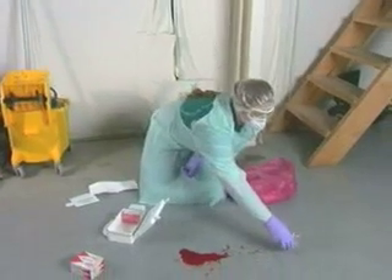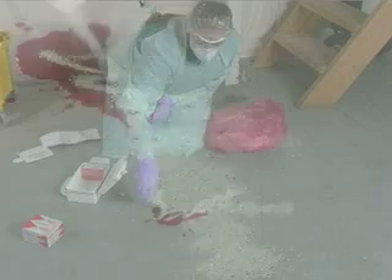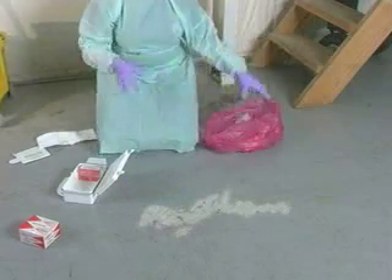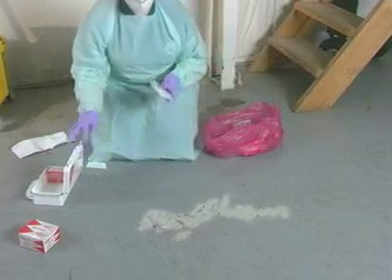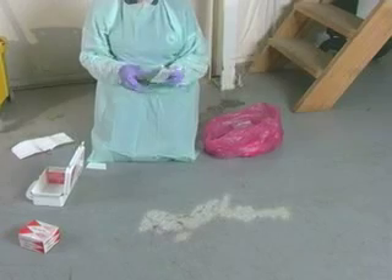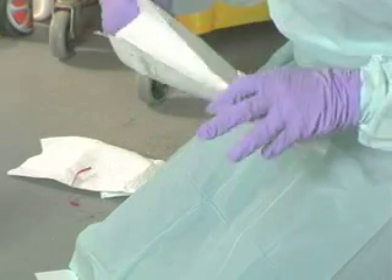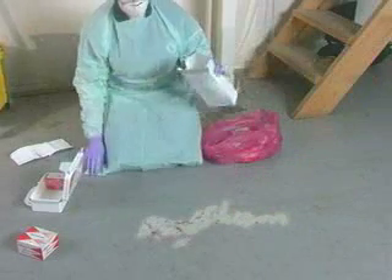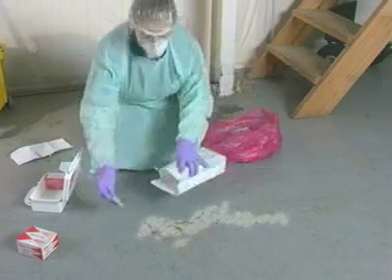Pour the absorbent material over the spill. Use a scoop to pick up the material.